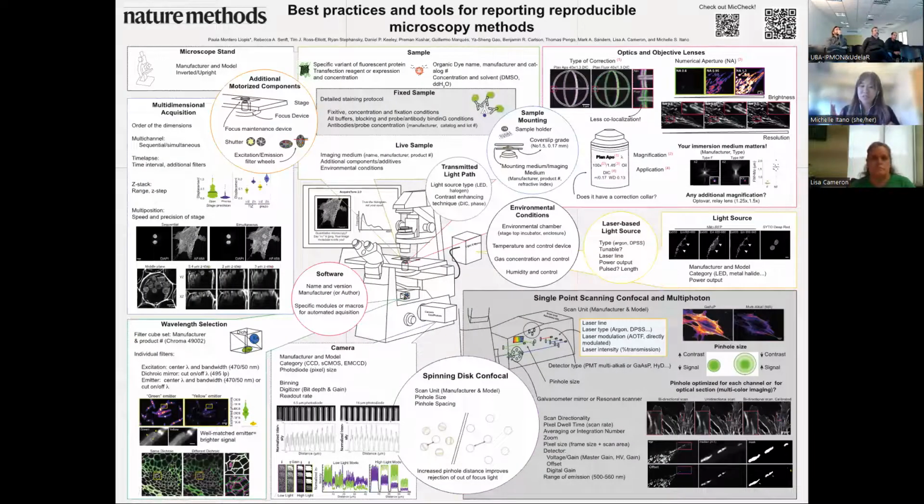So we made a poster so that this could be easy to reference. For us, it's something where we can address different stages of the imaging and different specific hardware, to let people know what it looks like when you have different numerical aperture lenses, or different corrections for chromatic aberration, or if you don't. When they see something on their microscope, they can look and see, is that looking like this? Could that be due to that? And if so, how might I control for that or adjust for it? All of these images are also in the figures of the paper, which go through many more details, just to show people how things can be affected by these reported details.